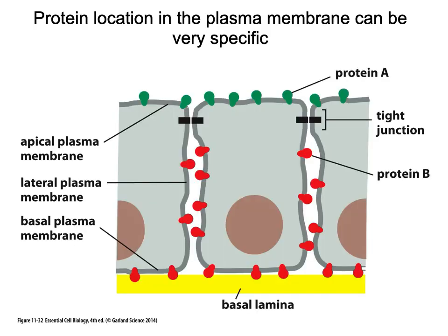You might remember from our chapter 11 talk, I showed this figure where we have these proteins that are localized in the plasma membrane. We want to keep in mind that distributions of proteins within a cell can be different. But by using the technique of photobleaching, we can bleach an area of the cell, basically deactivating those fluorescent proteins because we've damaged them with the laser, with this light.